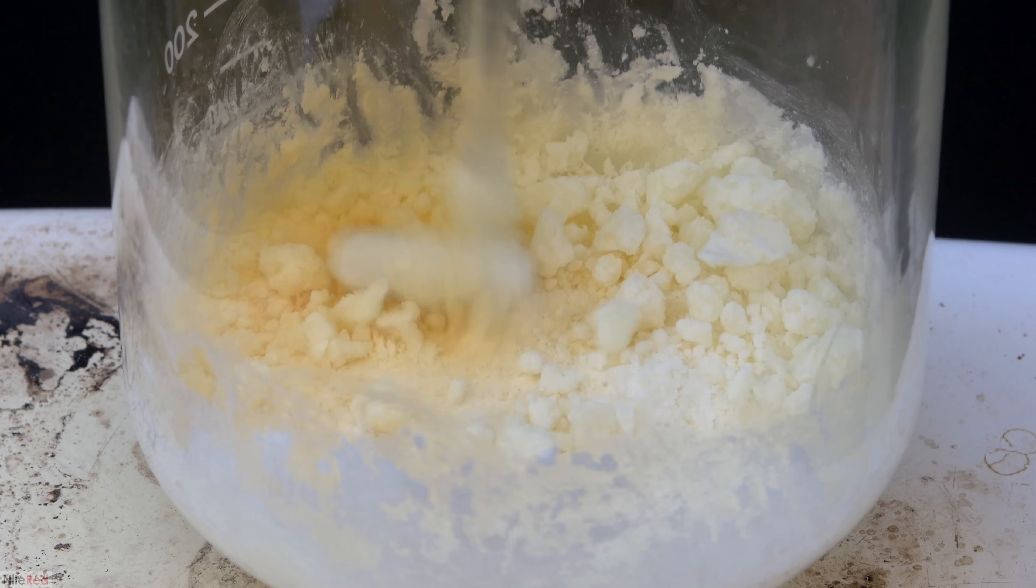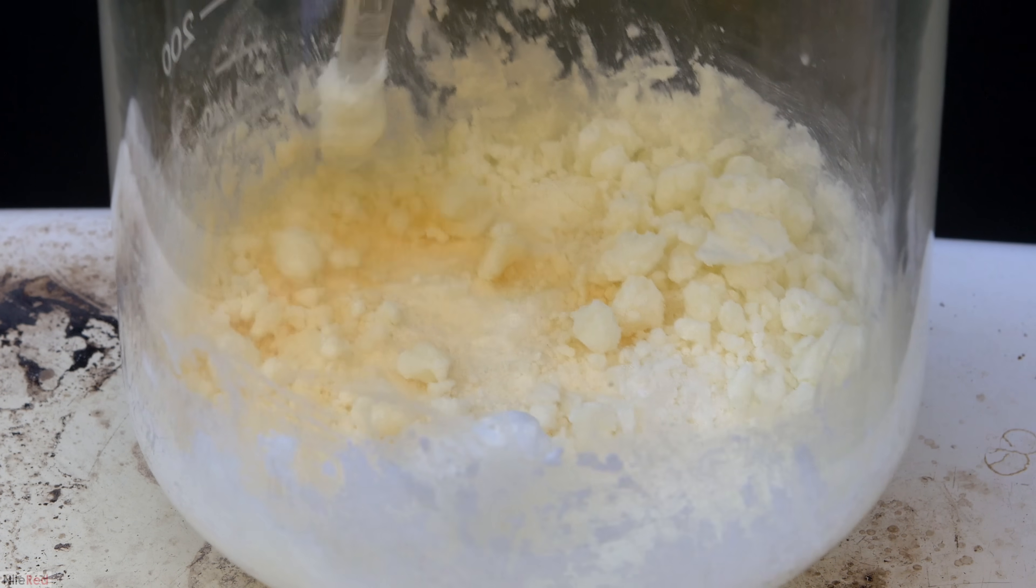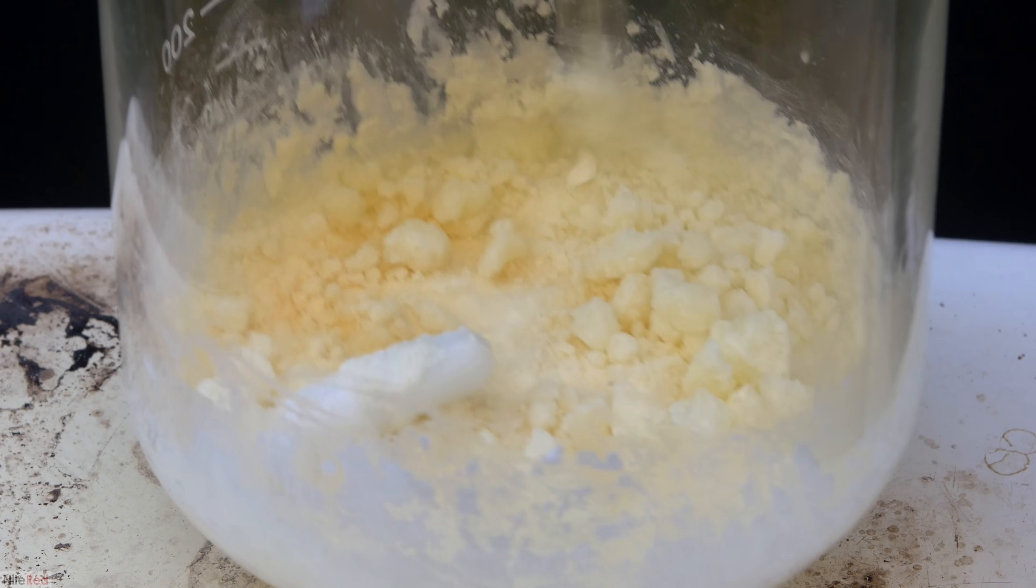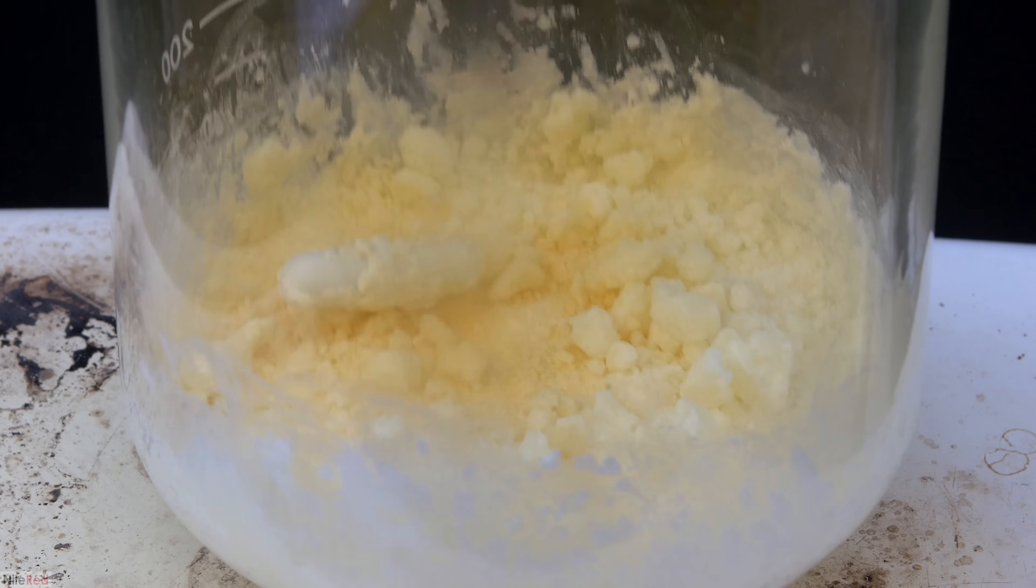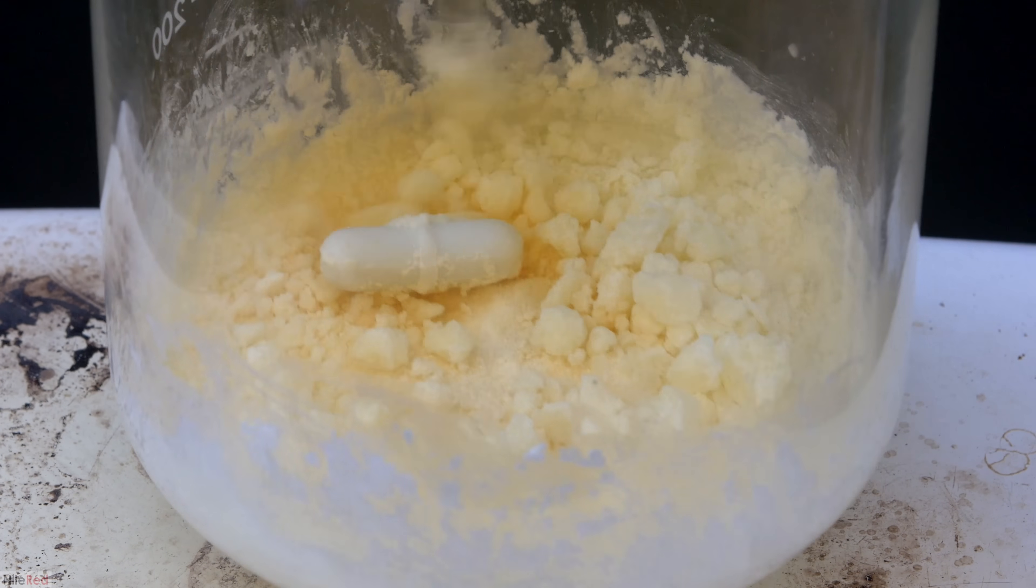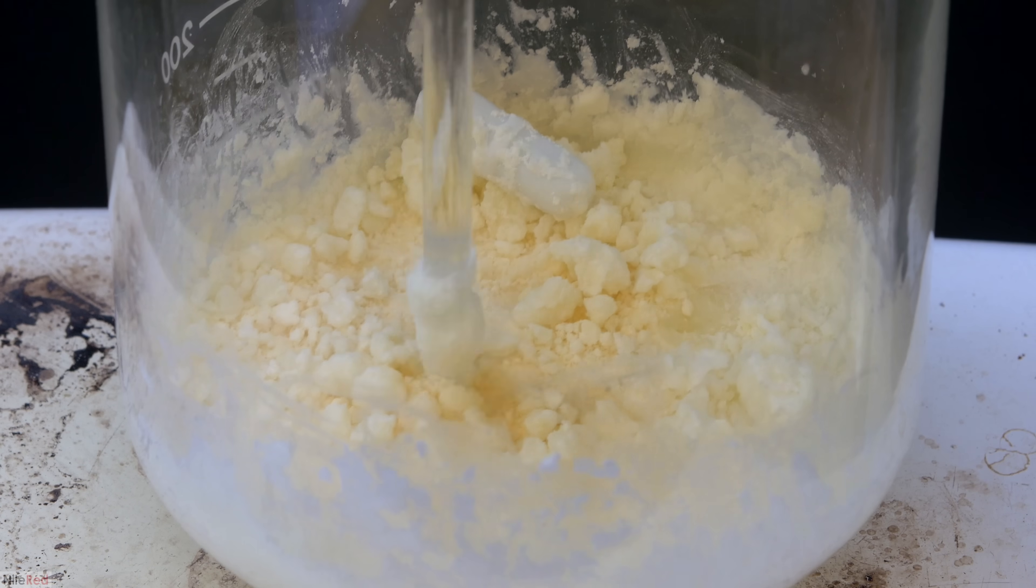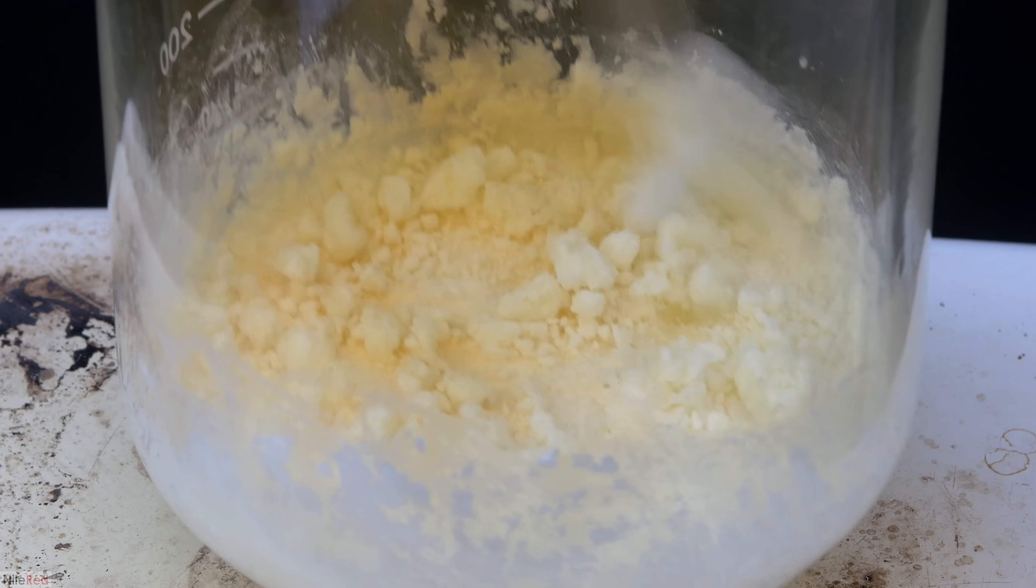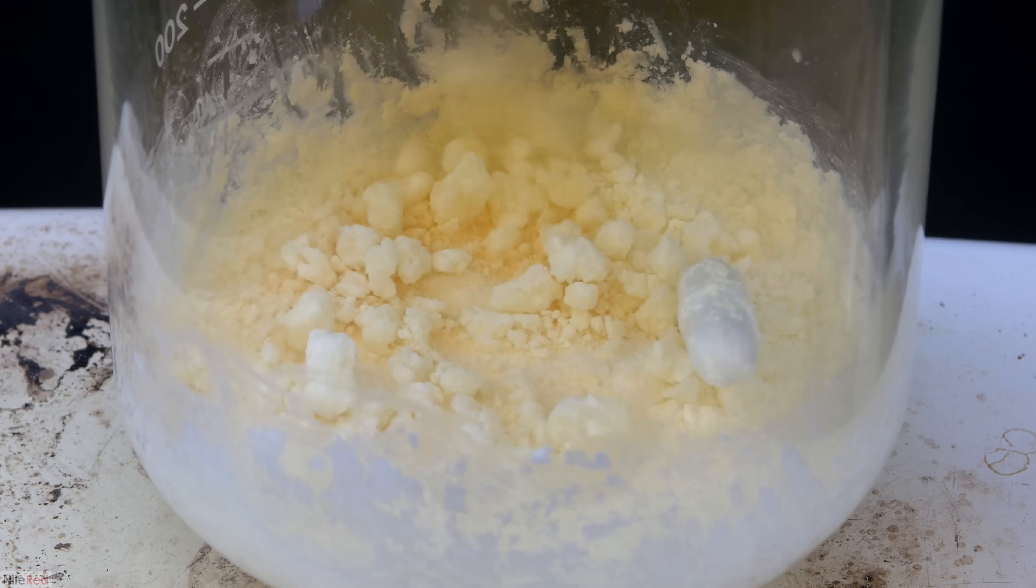The mercury(II) nitrate decomposes at relatively low temperatures, but to get a decent rate, I cranked the temperature up pretty high. However, it's very important to not let it get hotter than 400°C, otherwise our mercury oxide will decompose back into mercury metal.